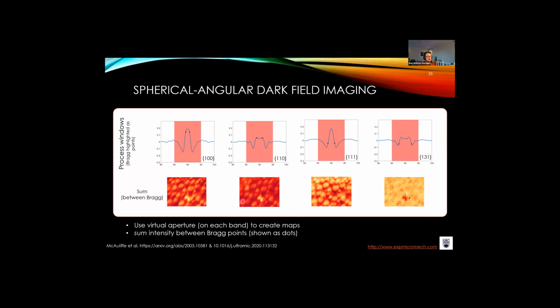But what's kind of neat is that we could perhaps look at a reconstructed map based upon the intensity on this Bragg peak. So if we reconstruct this map, we can see the reconstruction of the 100 crystal plane families, the reconstruction of the 111. We sum effectively the total intensity within twice the Bragg angle, and we can start to see these spatial maps really beautifully show that the gamma-gamma prime is revealed with exquisite spatial resolution. Again, recognizing the length scale is about 50 nanometers in this little bit is really good, but we see some peaks where there is effectively an invisibility of those two different crystal structures. And so this is a new form of imaging that's well set up for this sort of single crystal nickel superalloy analysis here.